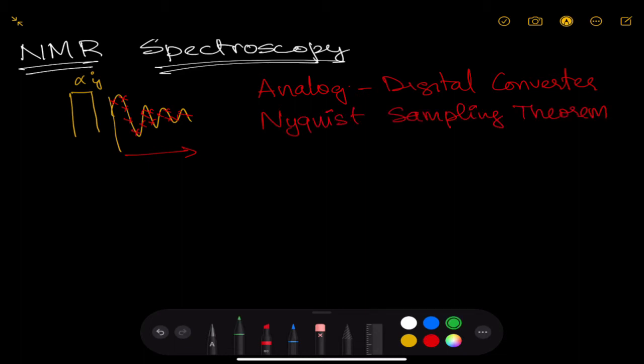Briefly, the Nyquist sampling theorem says that if you are trying to capture motion that has a frequency nu, you should at least sample data at twice the frequency so as to ensure you get the real frequency nu. You might have observed this at times when you look up at your fan when the light is a little dim, you end up seeing the fan rotating in the opposite direction, although you definitely know it is rotating in a certain direction.